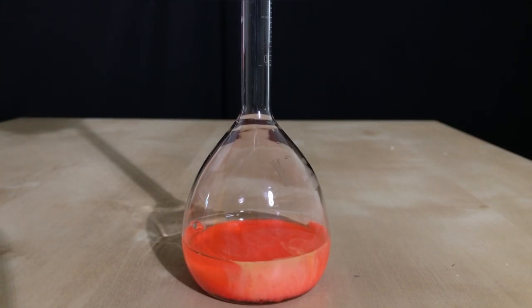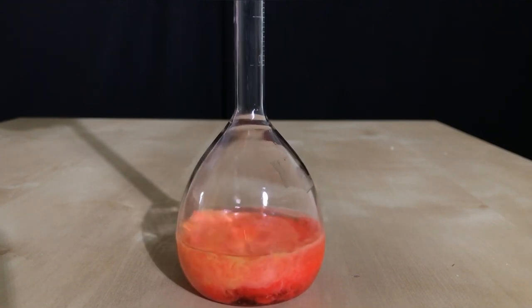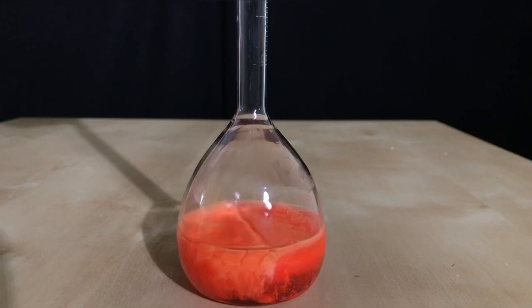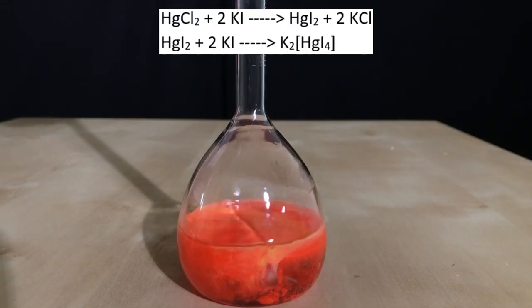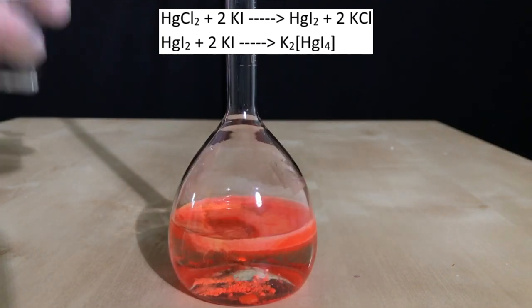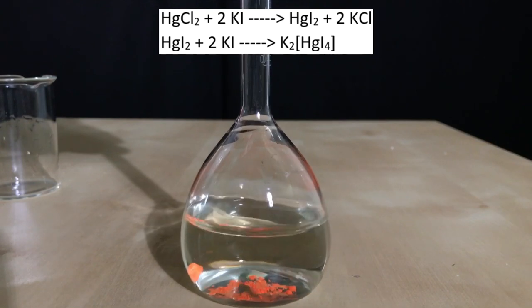When we add even more potassium iodide solution than needed, something interesting is going to happen again. The red color is going to disappear. This is because the mercury iodide reacts with excess potassium iodide to form potassium tetraiodomercurate. Potassium tetraiodomercurate is water soluble as you can see here.